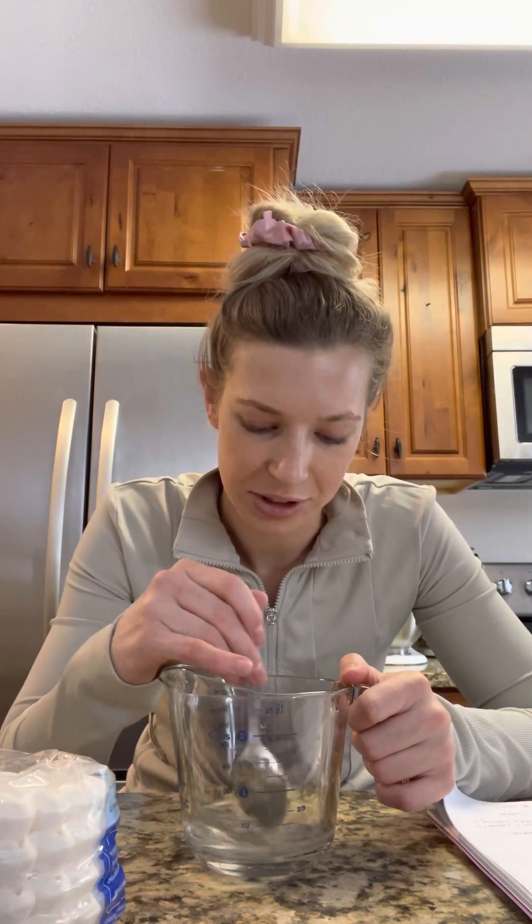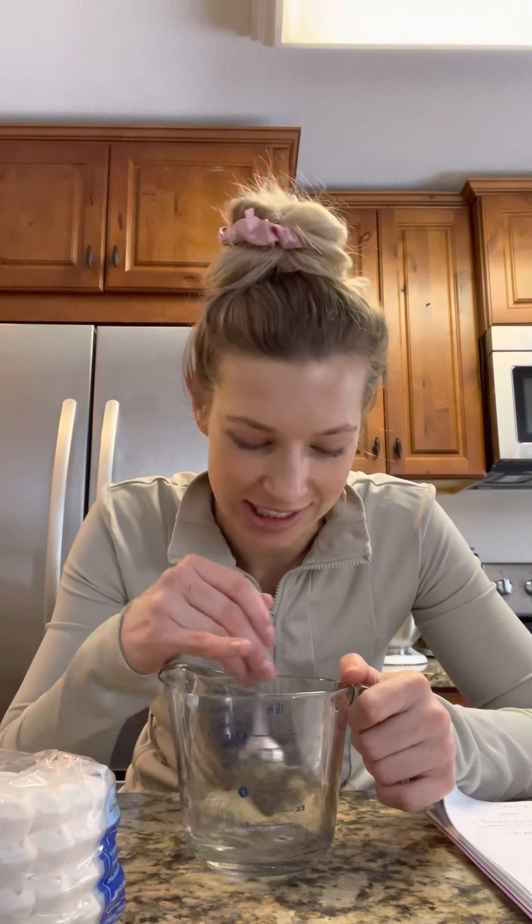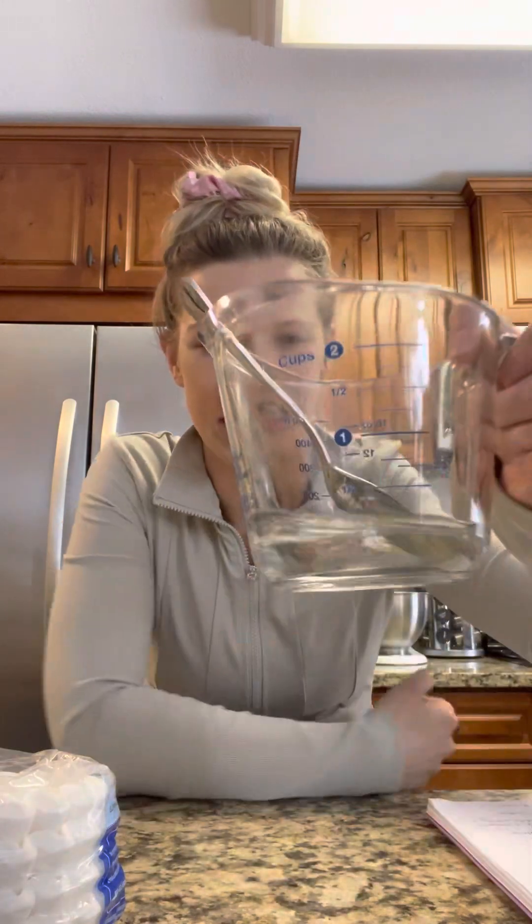I have coffee filters right here. I'm also worried that this experiment might take a while and I want to make sure it's under 10 minutes. That looks pretty clear to me.